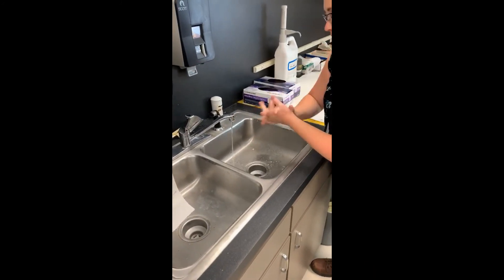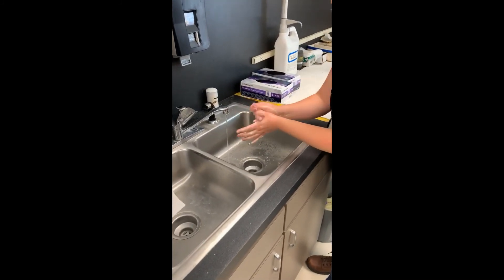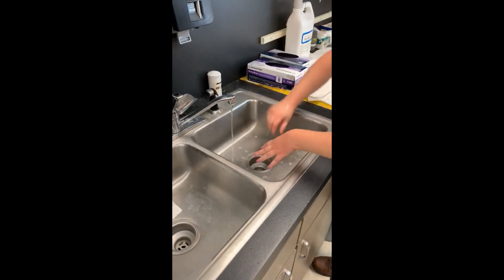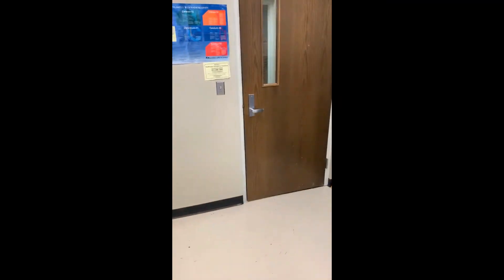Always wash your hands prior to leaving the laboratory. Even though you wear gloves, that doesn't mean they are impervious to the materials you handle. Best practice: wash your hands, then secure your laboratory space.